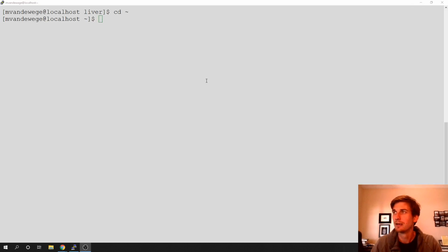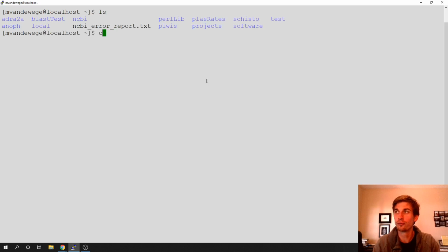So in this video, I am largely demonstrating assembly. We have our reads already made, so we're going to assemble these reads. During the sequencing step, these transcripts get cut up into small fragments, say 150, 300 bases, whatever. When we sequence them, we don't know where they go, and we don't necessarily know which gene they came from. But what we can do is look for overlapping reads with identical sequences that overlap.